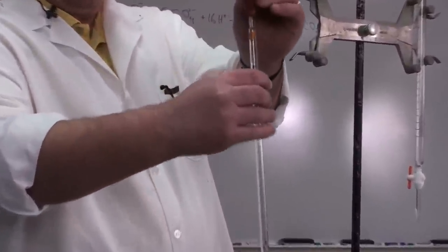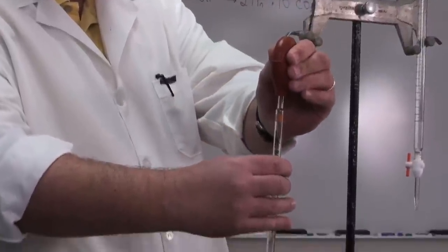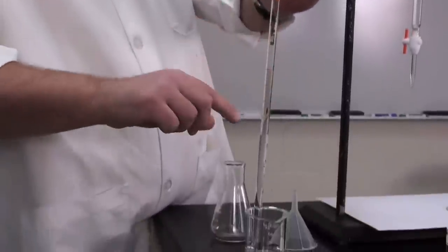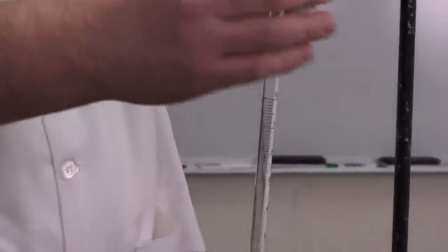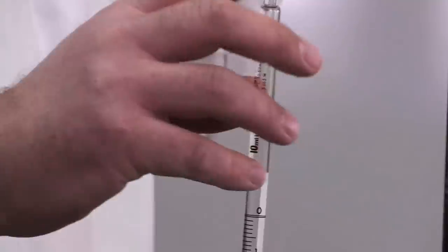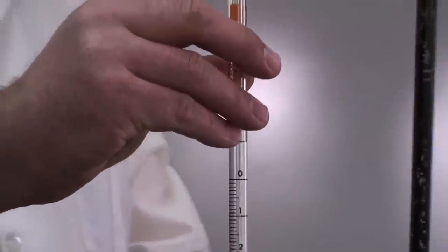That way if my pipette happens to be contaminated or I do something else silly, I've only contaminated this small amount and haven't contaminated my stock bottle. I'm going to put the bulb onto the pipette fairly lightly because I'm going to want to take it off quickly afterwards.